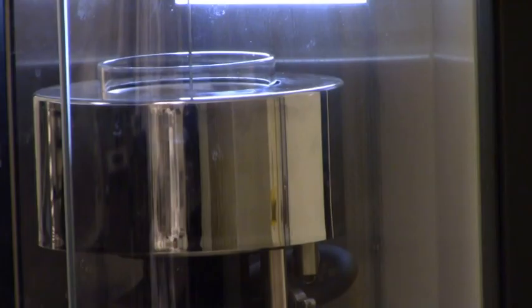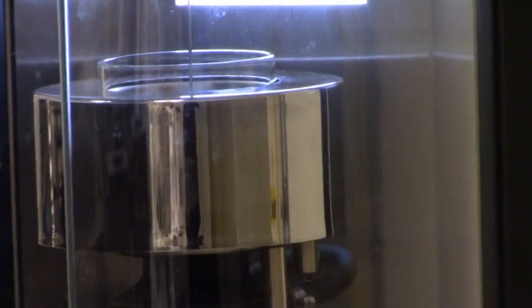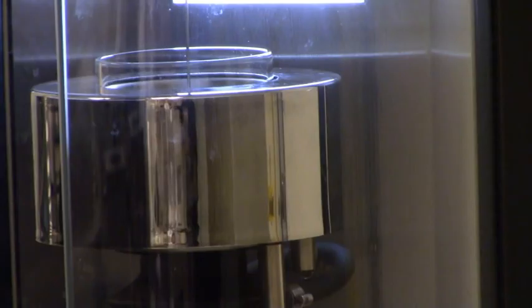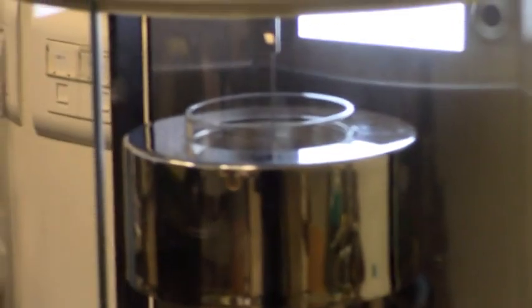Now I need to make them close to one another, but the plate should be kept dry and clean in the air and not touch the water surface. If the camera can zoom in, I can see some reflection of the plate on top of the water. So this makes me sure that I'm close enough, but not too close. Okay? So I'm ready to start the module here.